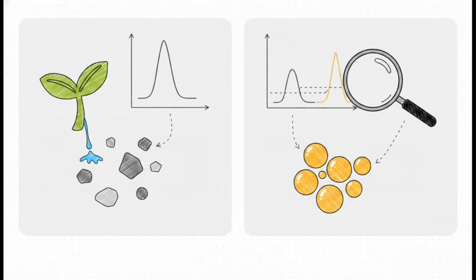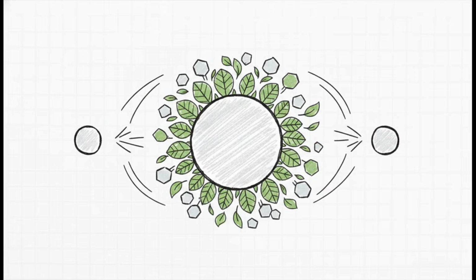But how do we actually know that the plant extract did its job and created the nanoparticles? While the researcher compares the FTIR spectra from before and after the reduction process, they're basically looking for the disappearance or the shifting of specific functional groups like OH or C=O peaks between the two states. When they see that shift, it's the definitive proof. It's the smoking gun that confirms the reduction of metal ions down into zero-valent nanoparticles. And it actually does double duty here. During this green synthesis, FTIR also identifies what we call capping agents.